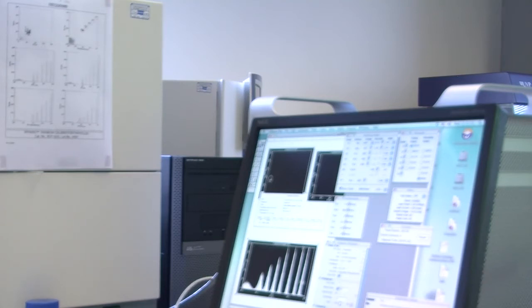Okay. So I will give you the stats, and here we've got percentage, whatever that is, something 0.8, no, 90. I can't read it. But what's the difference for here, like double positive? Yes. So you can see here there's only 1% double positive, and here it's 90-something, 91%.